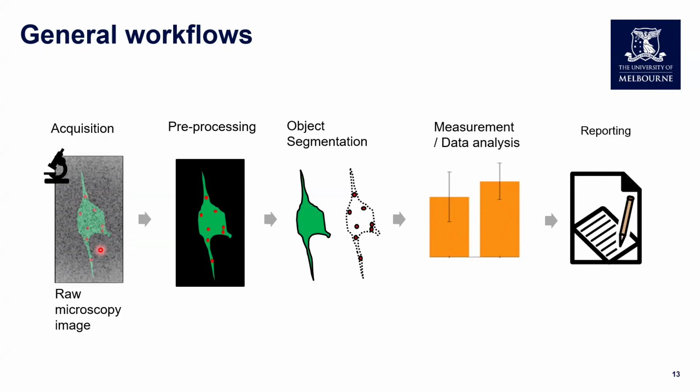Well, depending on the type of analysis, we can either use a single software package that covers the entire workflow, which means all of these steps, pre-processing to analysis to reporting, or we may have to use different image analysis software for each step because we might need to access specific functions. So I'll go through each of these steps in more detail in the following slides.